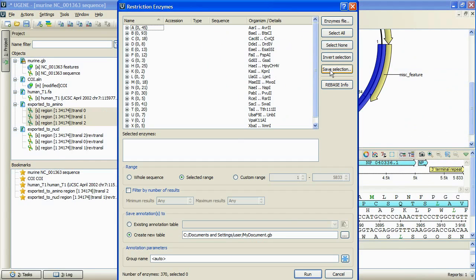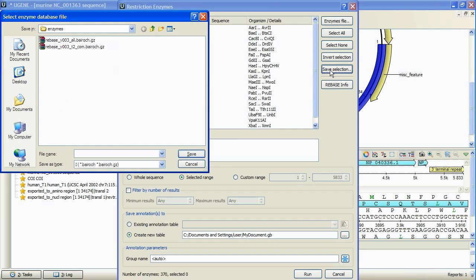In the new version of UGENE, we can save current enzymes selection by pressing save selection button for later use. Also, we've updated the rebase database files contained in the UGENE packages.